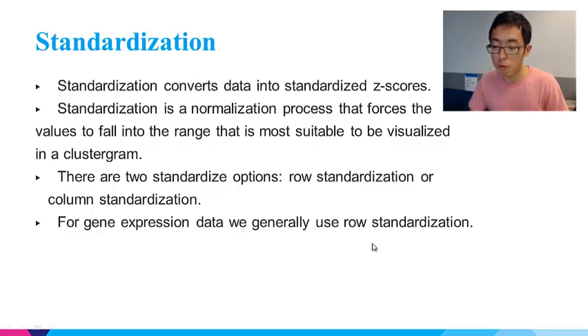There are two options: row standardization and column standardization. Row standardization calculates z-scores for each row, and column standardization calculates z-scores for each column. For gene-expression data, we generally use row standardization because we want to see for each gene how their expression values change across different conditions.